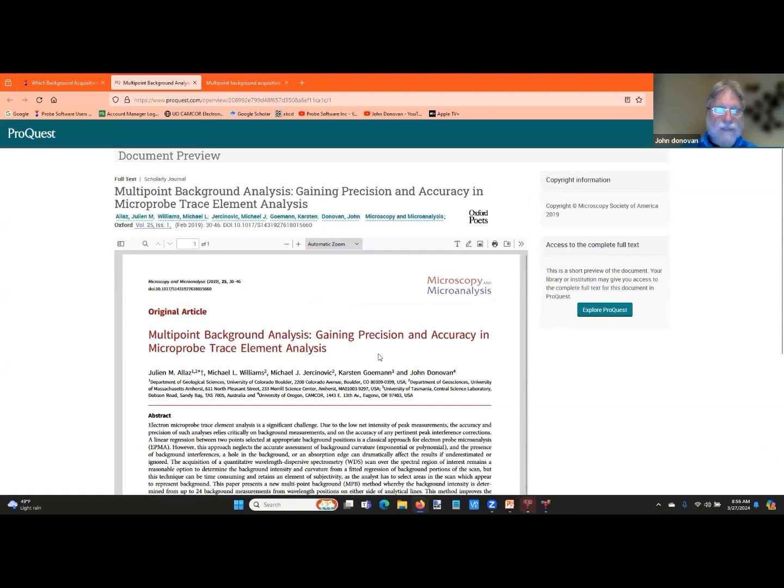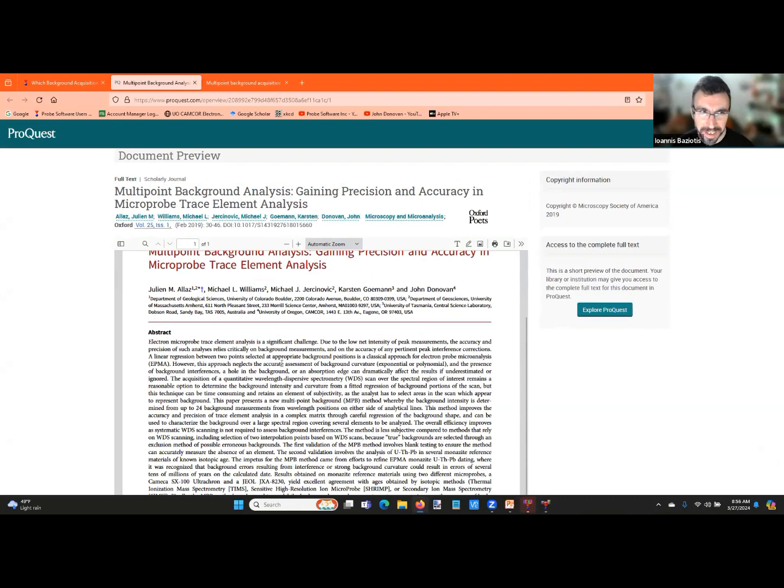I probably don't have access to this PDF on this computer, but this is the paper that you should read, and it goes into a lot of detail. This method can even be applied to data from an old JEOL or Cameca instrument.